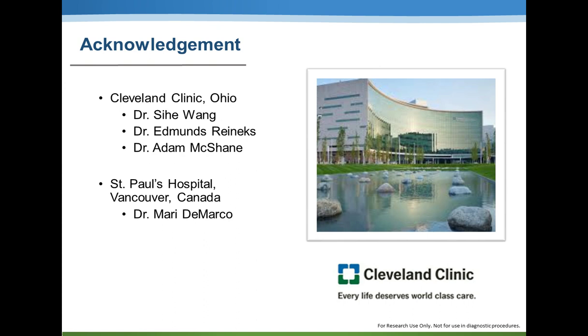There's an online tool called Peptide Cutter, where you can paste your protein FASTA file, the protein amino acid sequence, and then select the different enzyme types, and it's going to show you the resulting peptide sequences. So trypsin is not the only protease. There are definitely more on the market you can purchase and use for your study.